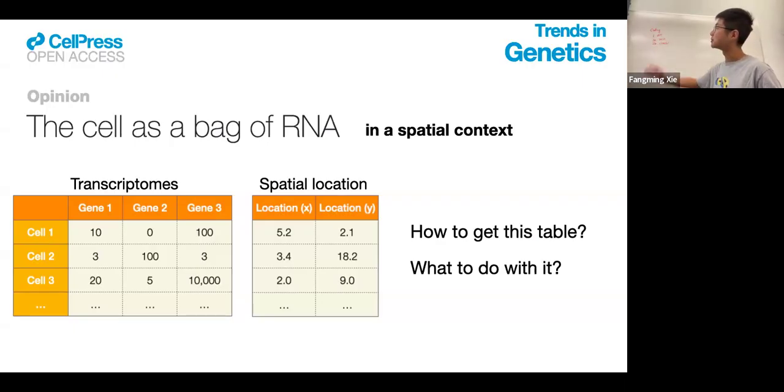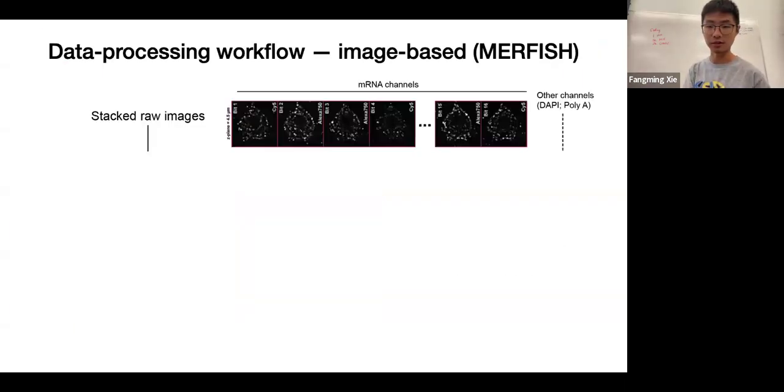So again, today we will talk a little bit still about how to get this table computationally. What are the steps that go from the experiment's raw data to this table? Just as an overview, but we will mostly focus on what to do with it once we have a table, once we have a data set like this. We will be doing 3 coding sessions, making a plot, doing PCA, making a UMAP, and I will give you plenty of time to try and show your results.